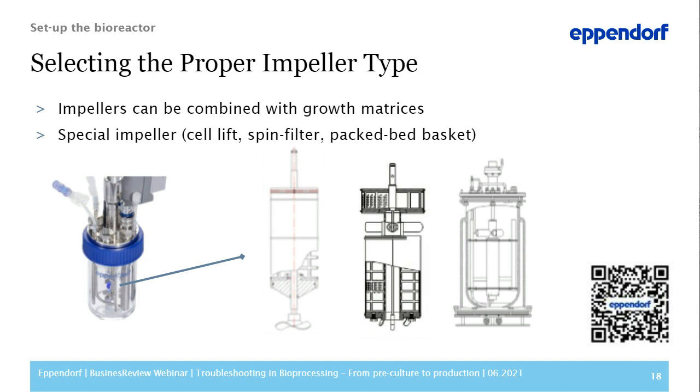Here is a QR code for an application note that details how you should choose different impellers for your process.